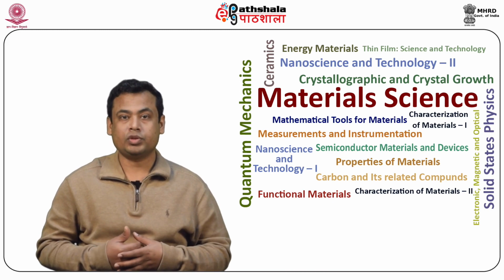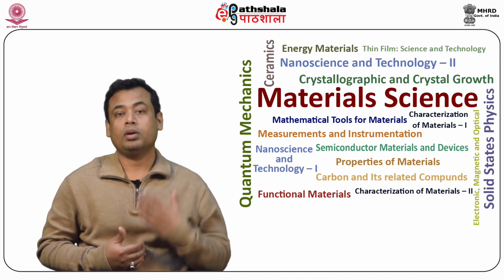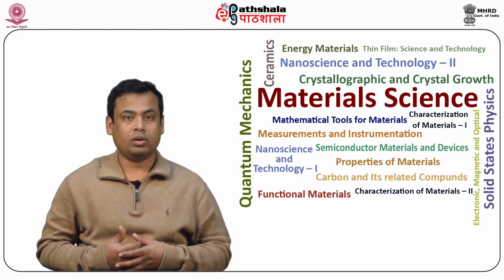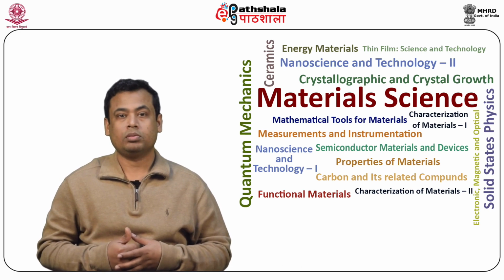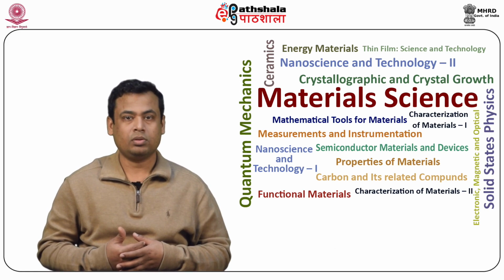Many fluorophores respond to environmental changes with lifetime variations. Lifetime measurements are also used to distinguish dynamic and static quenching mechanisms.